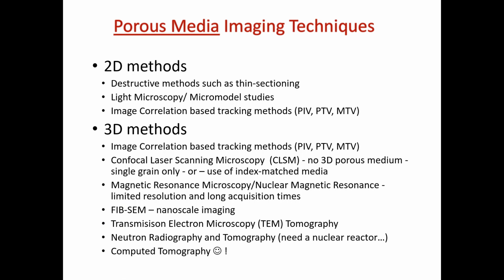With all of these, we will get to that, but I'm pointing things out ahead, especially since I have all of them on the same slide: the more you zoom in, the smaller your field of view is overall. The size of the overall object you can capture is smaller, the finer the resolution. And that is typically the problem.